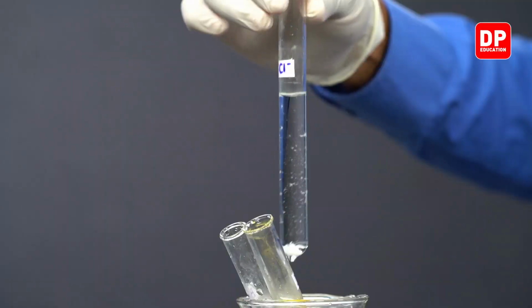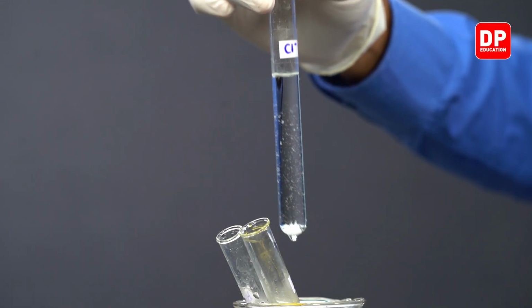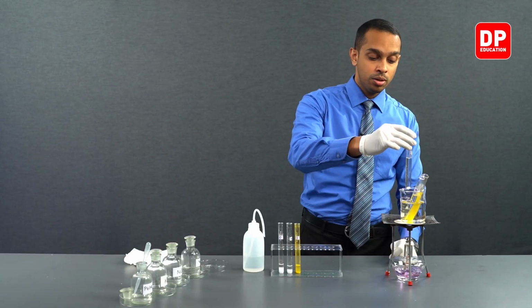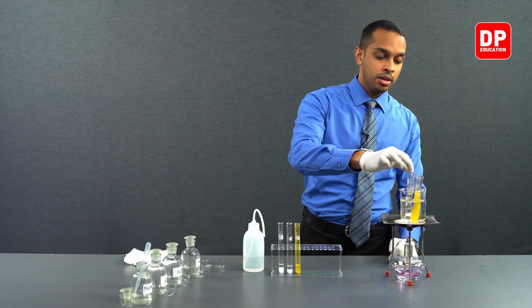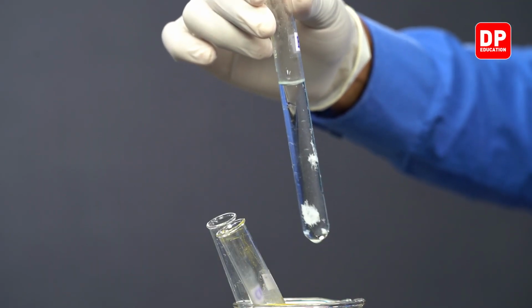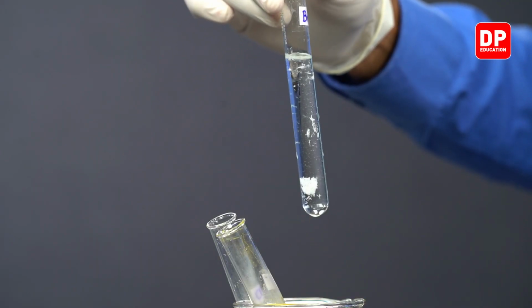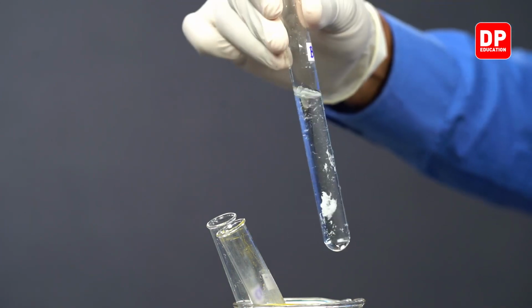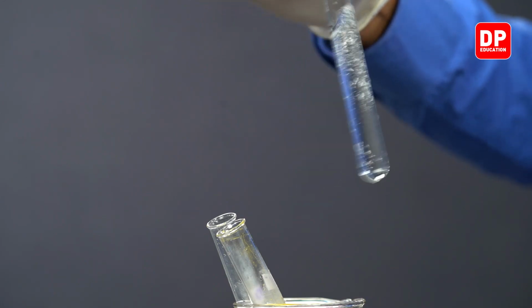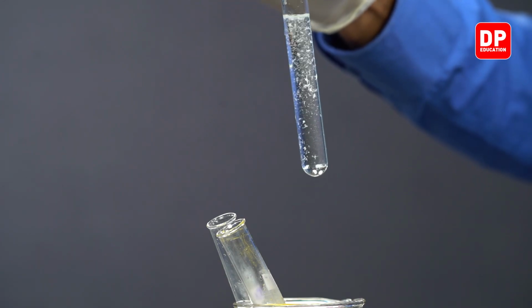So this lead chloride solid we had has now started to dissolve. You have lead bromide solid, which is almost completely dissolved by now. Still some of it remains. You can see when I shake it, it starts to dissolve a little bit better.